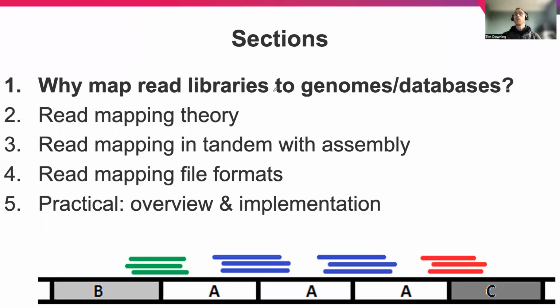So welcome to video 1 in G03, our course on read mapping. Today we're going to look at why we want to map read libraries to reference genomes or reference databases.